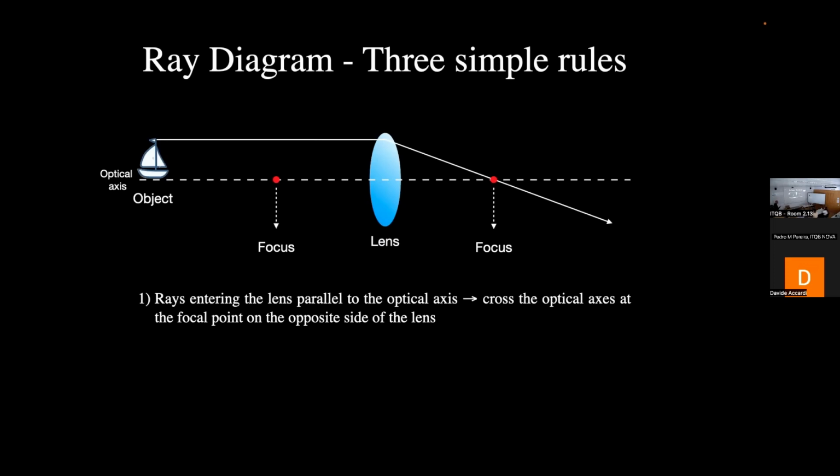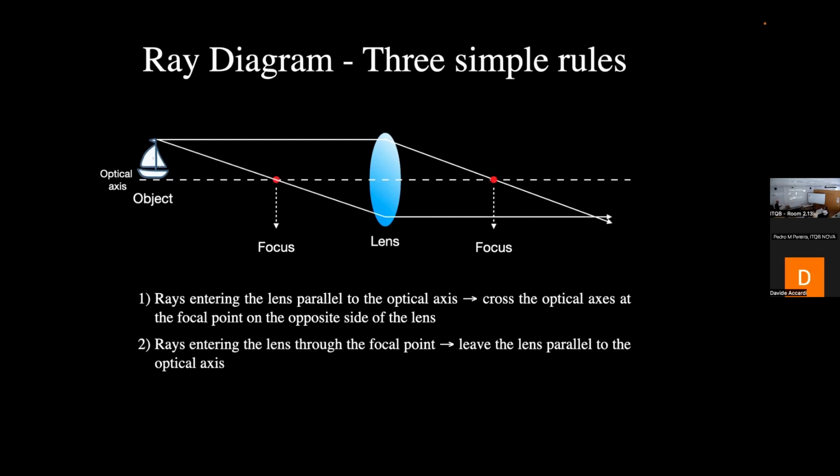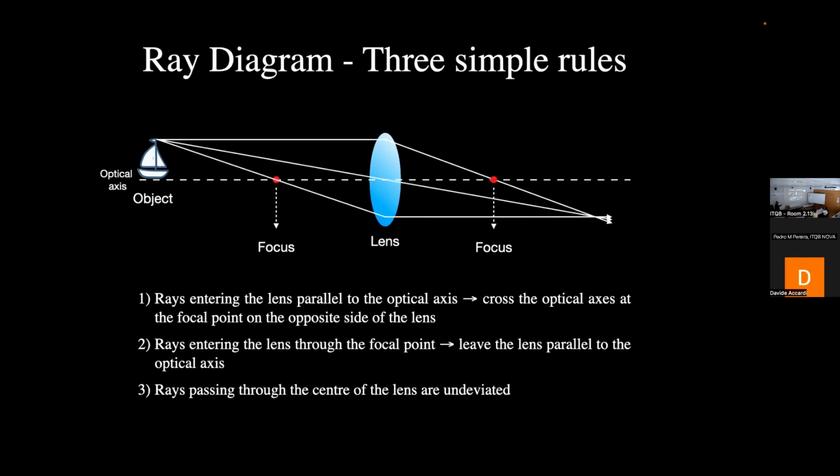All right. Okay. So when you have light that is passing through the front focal plane of the lens, then the light will travel parallel behind the lens, and we already saw this. But there is one more thing. When the light is actually passing through the middle of the lens, then it passes unchanged. Okay, very simple.